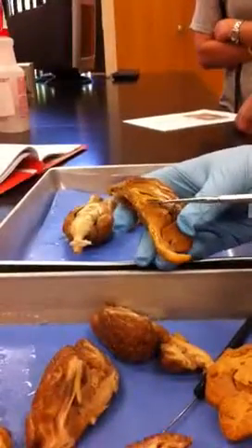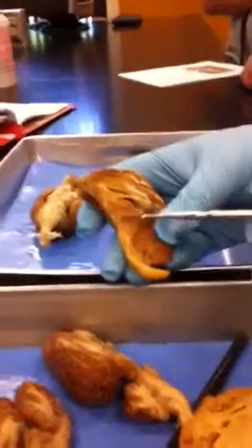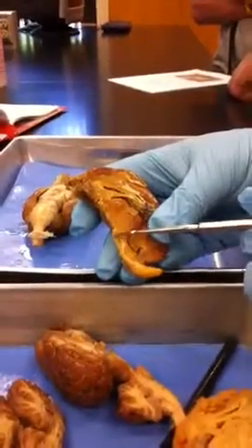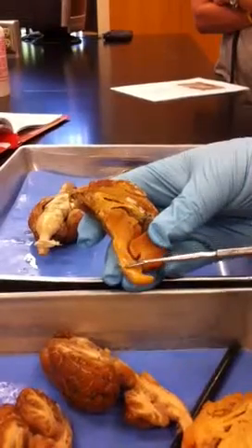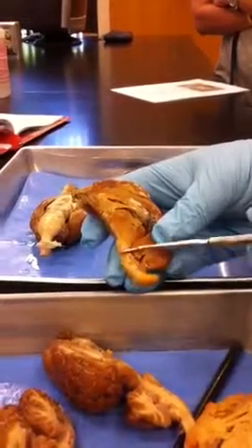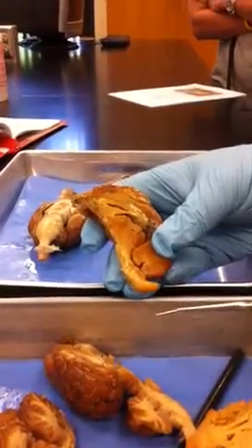So here was our thalamus and our midbrain. The pons is this little piece right here. And then medulla, you can use the cerebellum as a landmark for medulla oblongata. And then everything past that's the spinal cord.